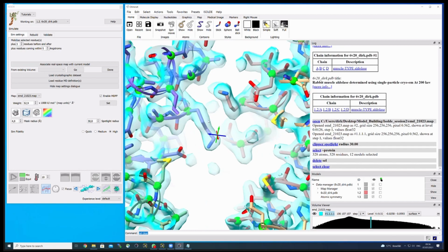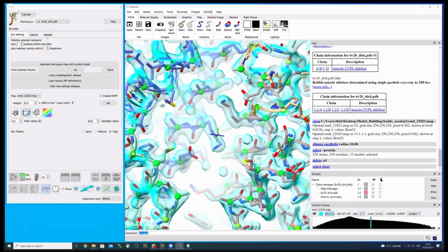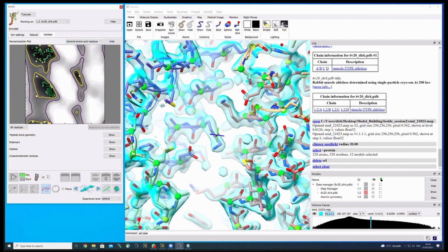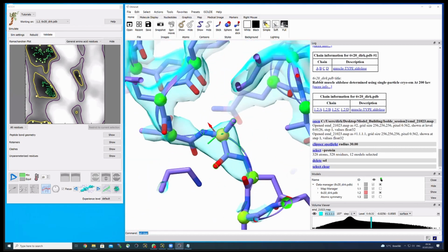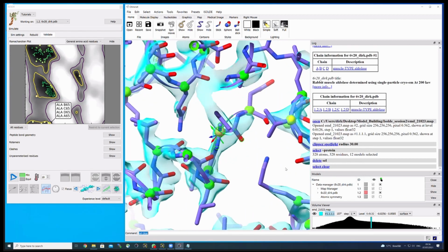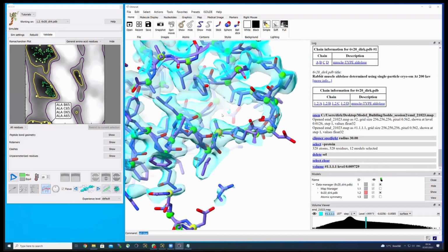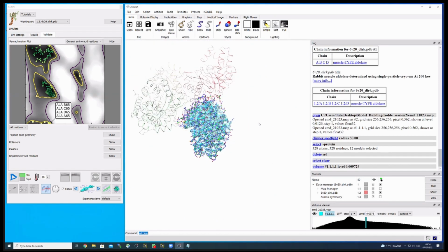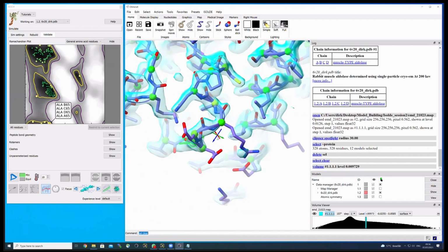Maybe Linda, you can give me a go. Almost. And meanwhile, I will just go into the validate tab. Here you can again see the backbone geometry of certain residues, which ones are outliers. For example, this one here could eventually be modeled better. And when you click on this residue, you will jump to the according sequence belonging to it. You will notice that in some areas the density is not as nice as it used to be in the core. This is because this is an area that belongs to the periphery, and typically there the density is a bit worse, but in this map it's still really good.